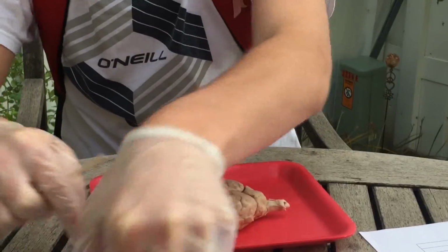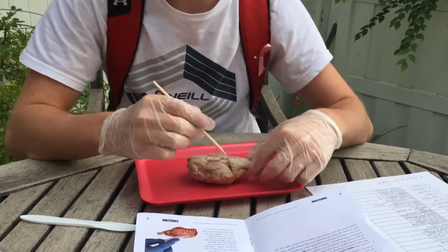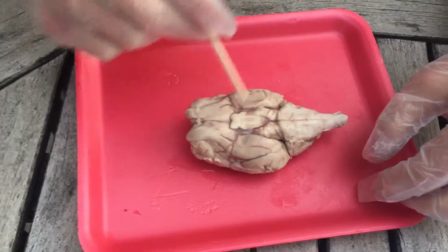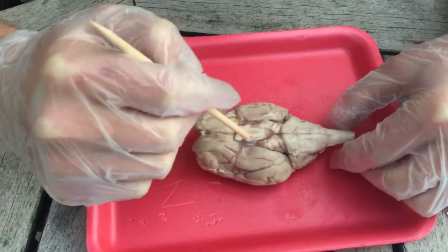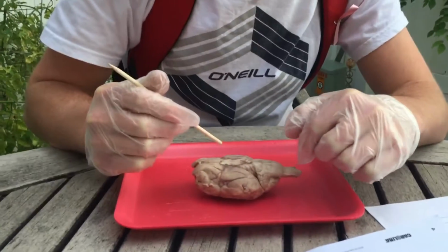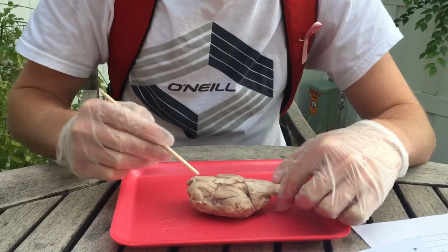And then, as we go on, we get into the hindbrain and the midbrain and the forebrain. So this is the hindbrain, and then the midbrain and the forebrain. That's pretty simple. And then we have the olfactory bulbs. The olfactory bulbs receive neural input about odors detected by cells in the nasal cavity. And the olfactory bulbs are right here.